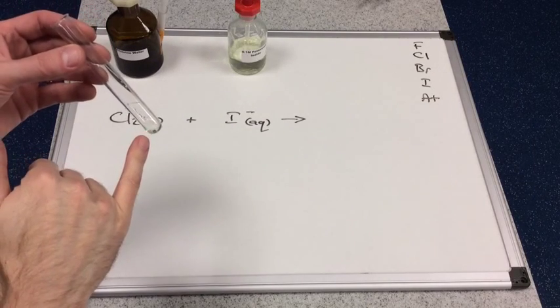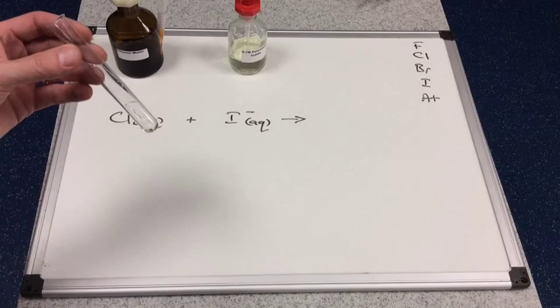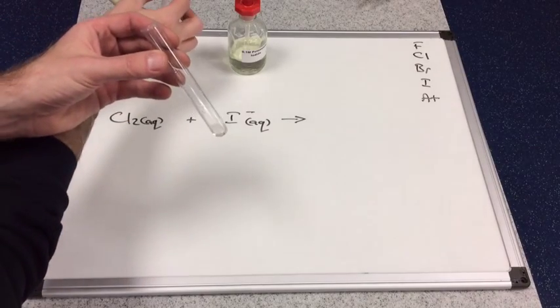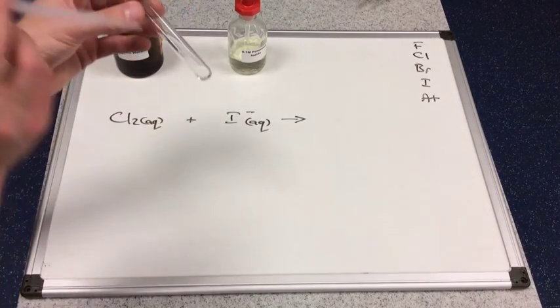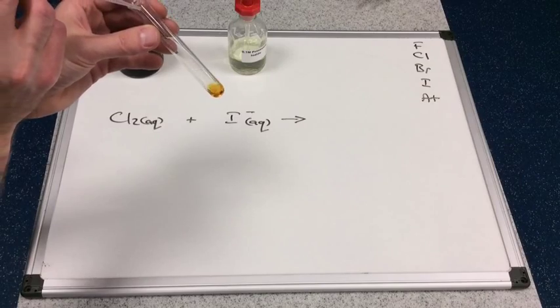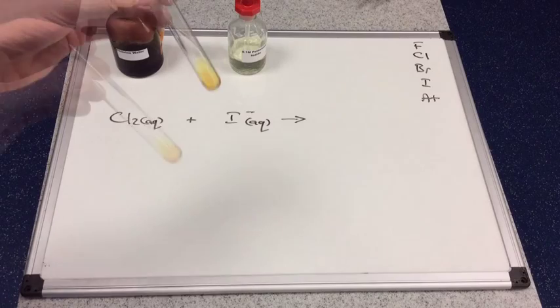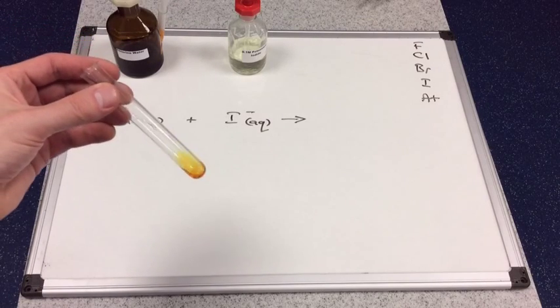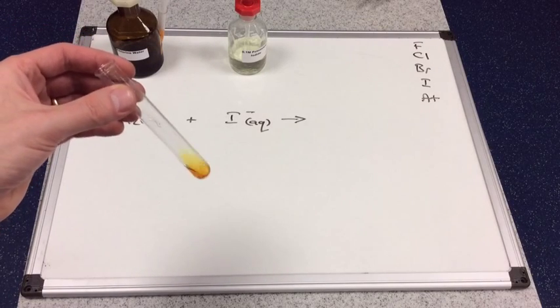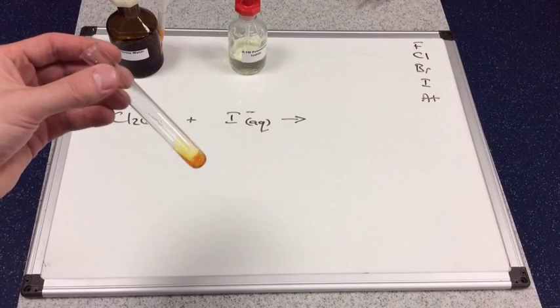Just put a small amount of potassium iodide solution into the test tube there. I've got some chlorine water already in this dropper, let's just put that in. You can see it's changed color so there's been a reaction. Obviously the chlorine has taken that electron and it's displaced the iodine.